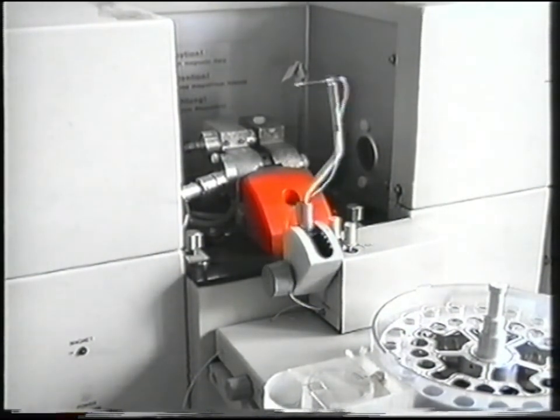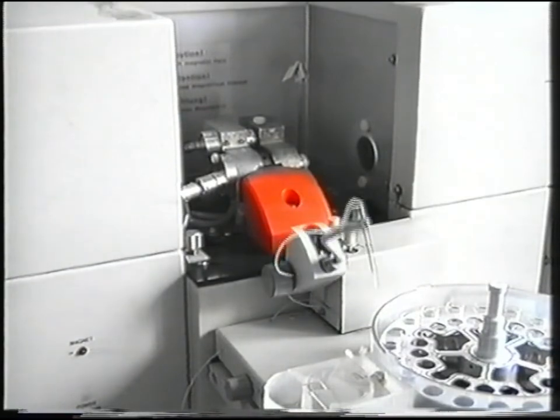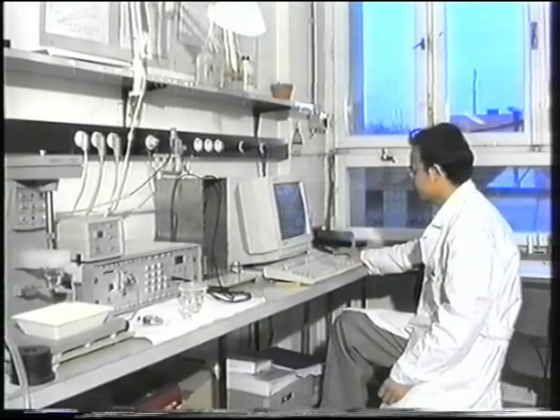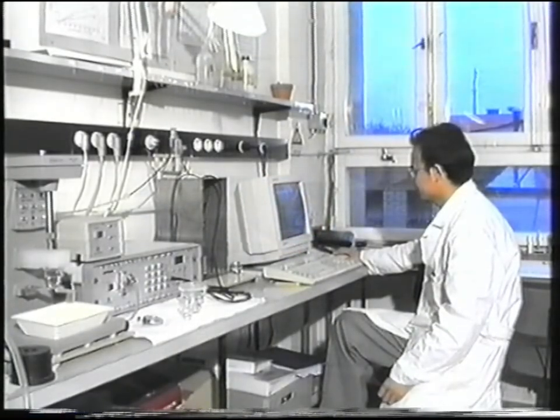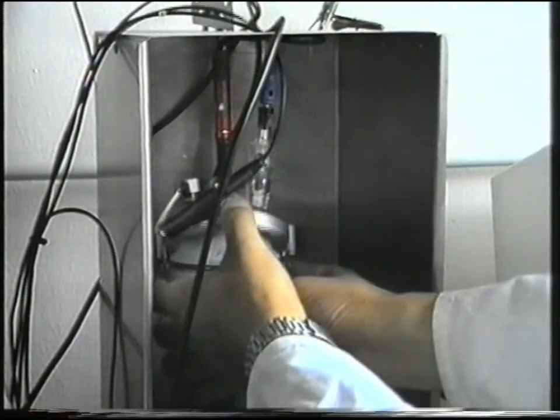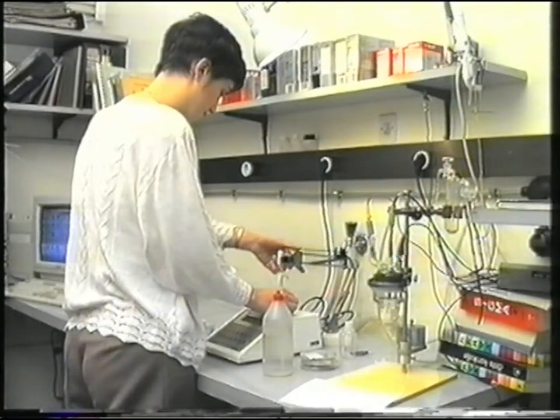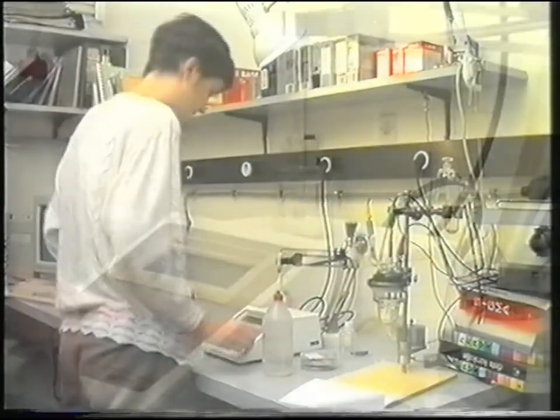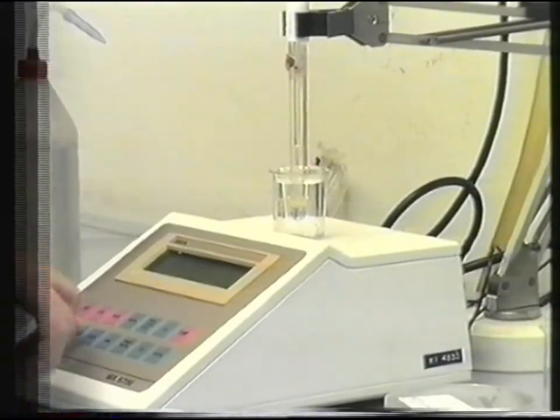In the field of the chemistry of atmospheric aerosols, the heterogeneous oxidation of trace gases and the formation of secondary aerosols are studied. The laboratory also specializes in determining the chemical composition of wastewater and solid airborne particles with regard to heavy metals, trace metals and so on.